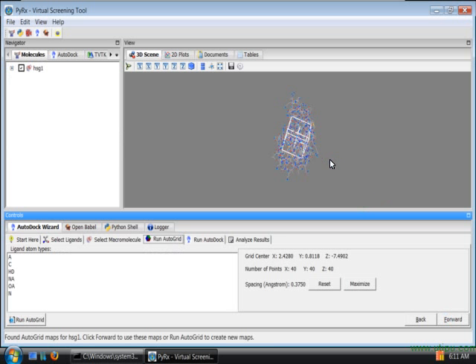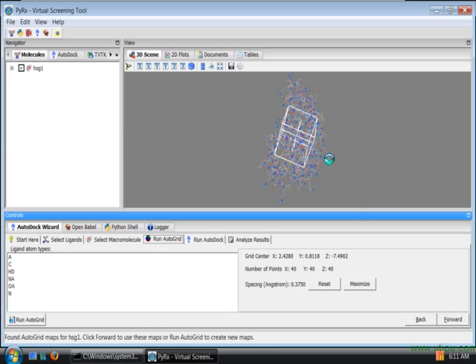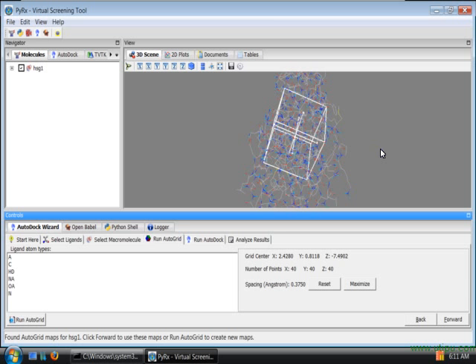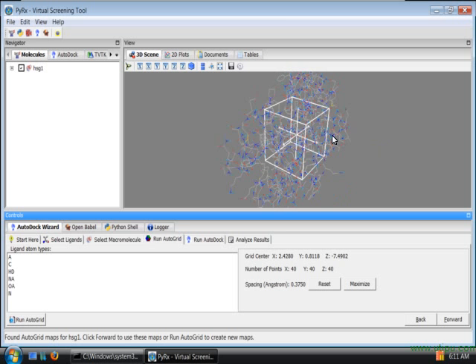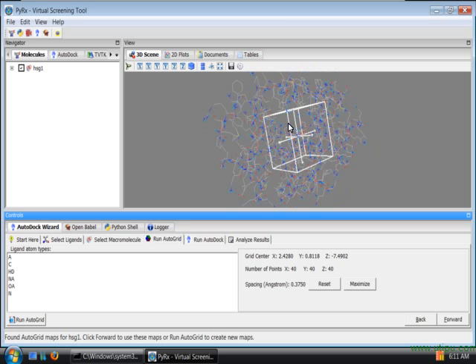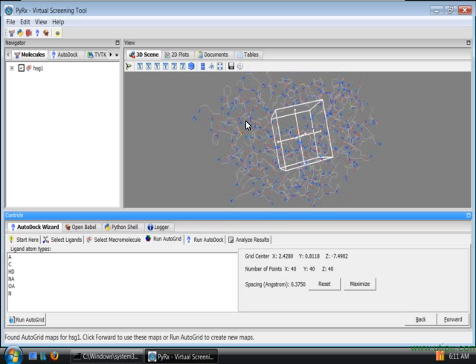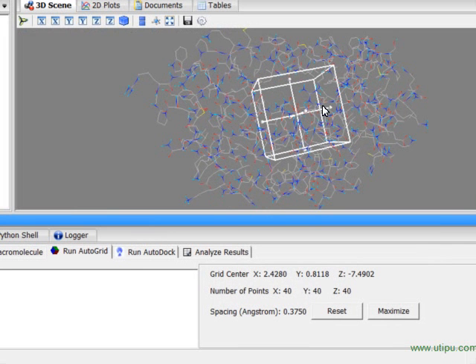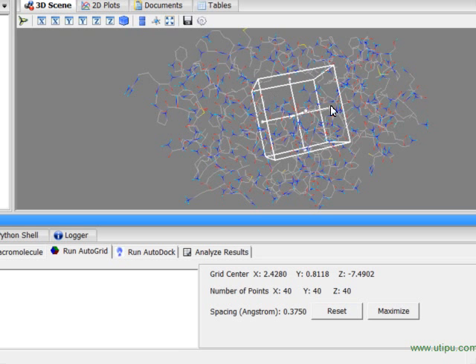This will bring us to run autogrid page where we can select the grid box for autogrid. Here Pyrex has selected some defaults for the grid box and luckily it has the active site for HIV protease in it.